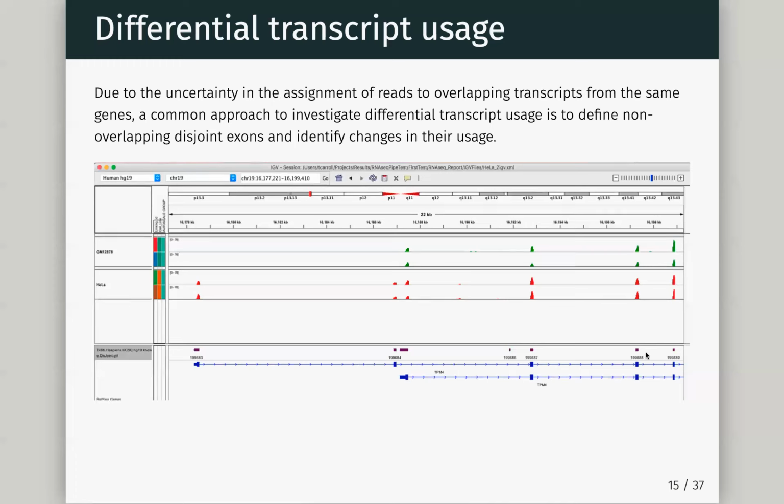So this is why we then do disjoint, so that we can have times where we can actually... hard to say here, but this is, I guess, just that much more of a complex example. But then we're going to try and count over these disjoint exons. And then, as I said earlier on, this may allow us to try and pull apart which transcripts are actually changing. This example is pretty straightforward, though. Anything which changes in these exons, we're going to believe is associated with that transcript.